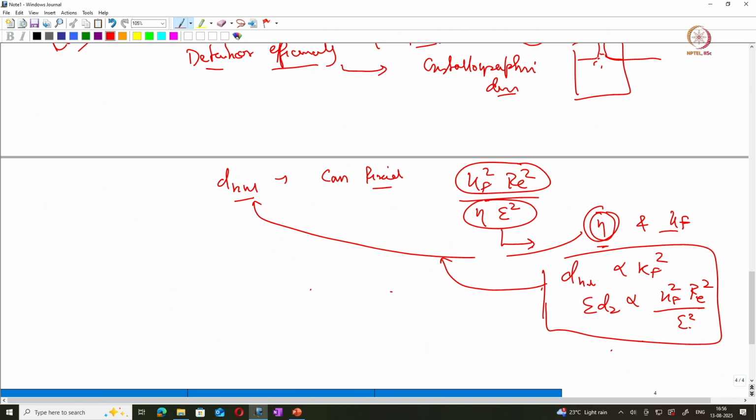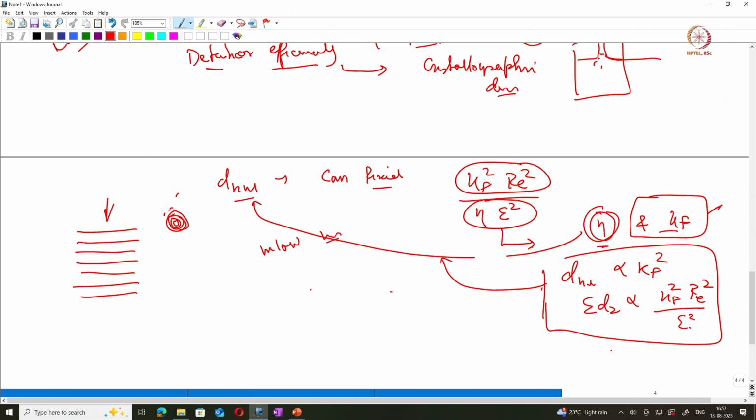Another thing is, if you have any crystallographic feature, atomic planes, and you observe the field desorption map of that particular pole, you will see these low mass density regions or the concentric rings, correct? So if you change the KF value much lower or higher, then what will happen?